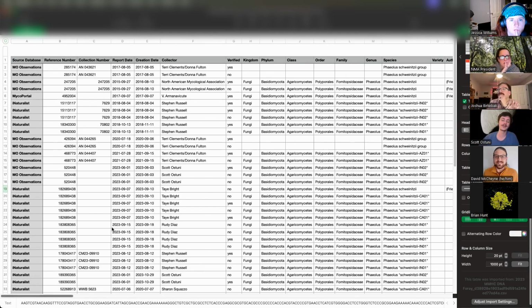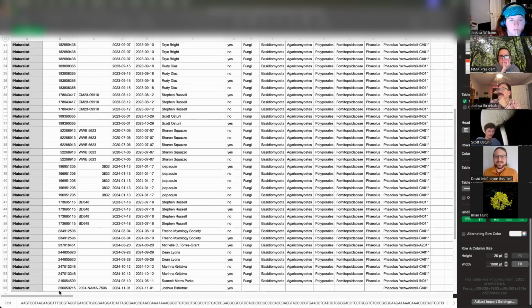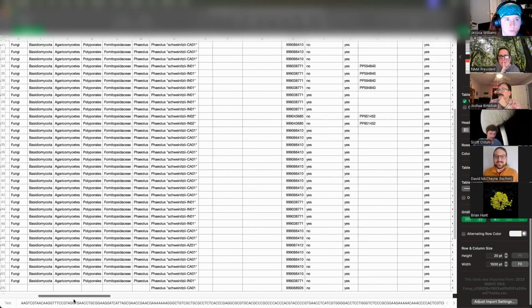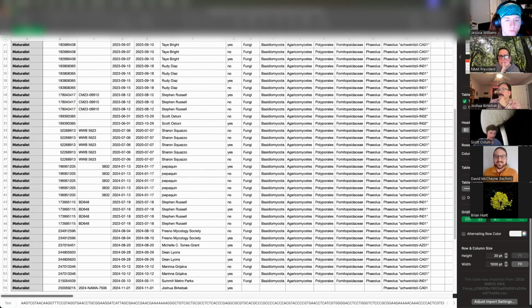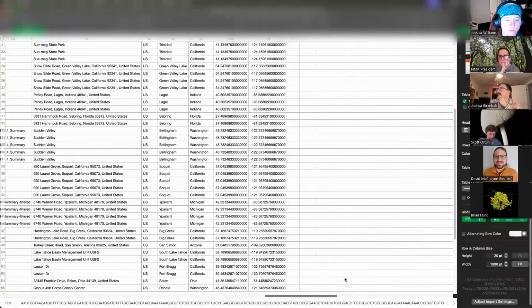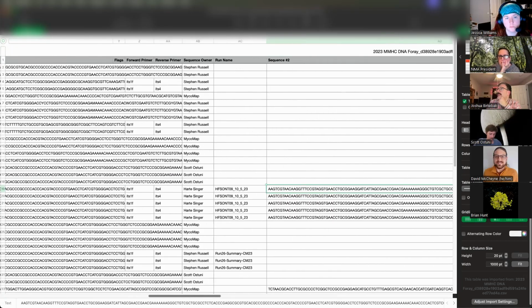There's a lot of ability to duplicate sequences through unreconciled workflows on the site. You can, through some workflows, make 20 or 30 copies of the sequence and get it loaded in. And stuff like the second read are cases where they recognize it and try to add multiple data instead of having a reconciliation workflow. I put feature requests in for a lot of these things.